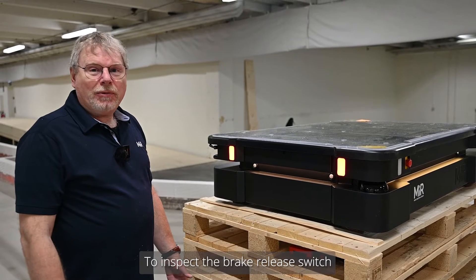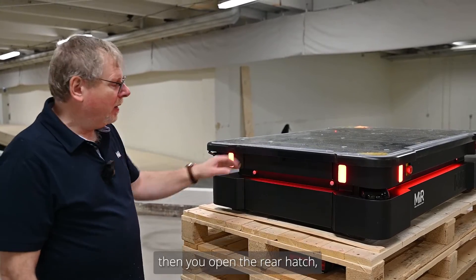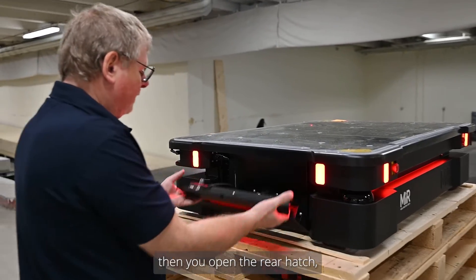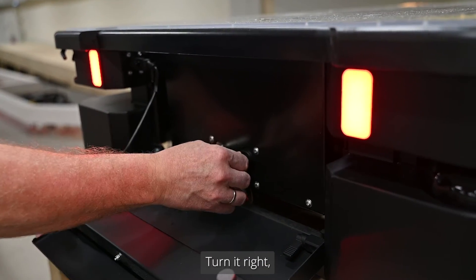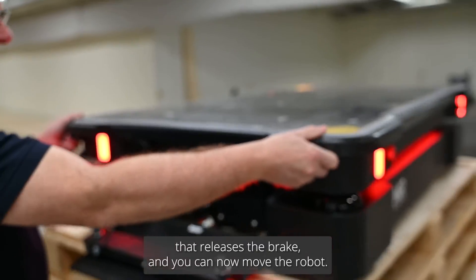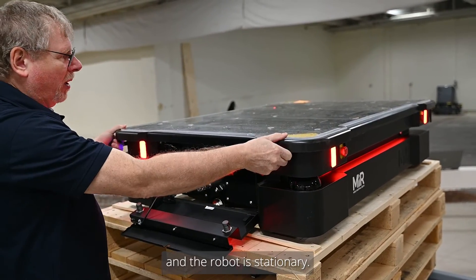To inspect the brake release switch, you first need to ensure the robot is powered up. Then open the rear hatch — the brake release switch is right here. Turn it right to release the brake so you can now move the robot. Turn it back left and the robot is stationary.